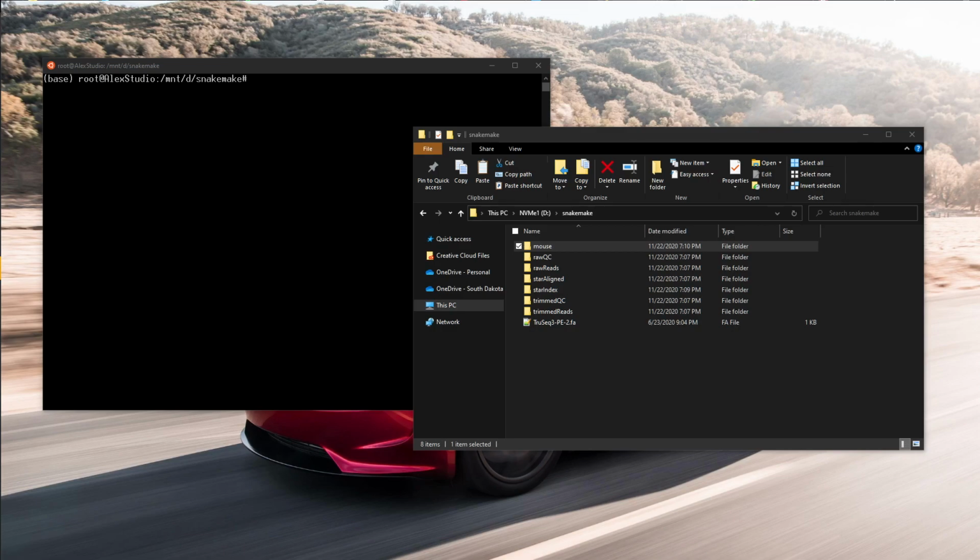Now we can move to building our environment. The nice thing about having environments, like I mentioned in one of the first videos, is that you can export it. Then you have this YML file, and from that YML file you are able to build a new environment that has the exact same programs and everything already installed. So if you're going to do Snakemake for RNA sequencing, you can make an environment that is specific for RNA sequencing, and when you go to launch the Snakemake, you just activate this environment, and you don't have to worry about conflicts or anything like that.